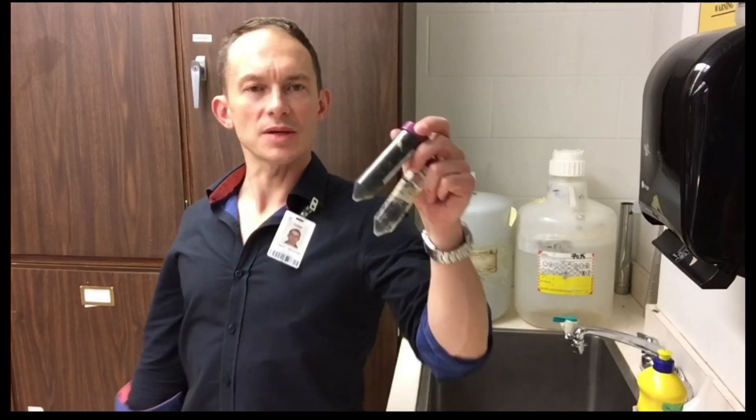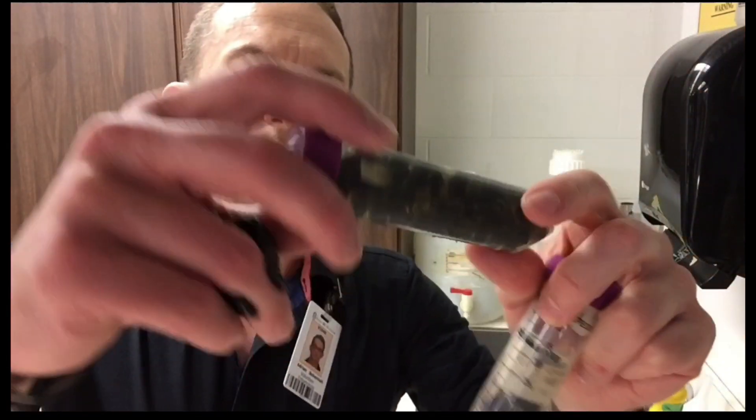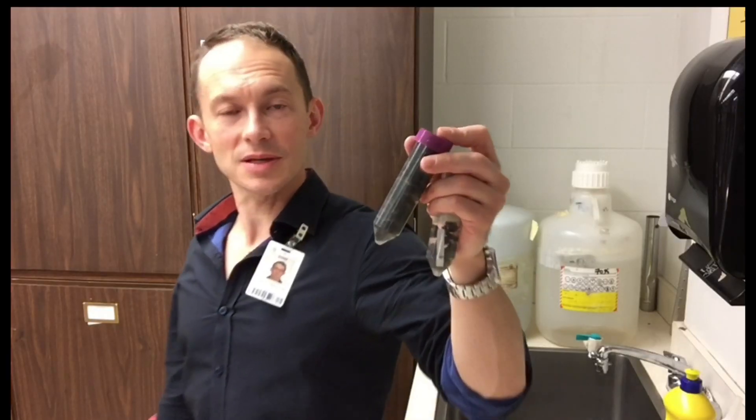When you collect bumble bees, you trap them in blue vane traps, collect them into alcohol, and put them in centrifuge vials like this. When they come out of here, their hairs will be all matted. There's going to be pollen and what looks like honey mixed in with the hair. So how do you clean bumble bees? I'm going to show you how to wash and dry bumble bees to prepare them for pinning to make very good entomological specimens.